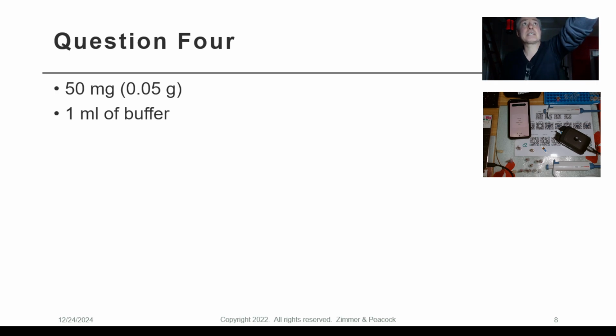I'm being very particular because at this moment we haven't started validating energy drinks. In fact, we have been buying them, but we have not done the science. So we'd love to get into energy drinks, but we have not done the science. So the only samples that we're supporting at this moment would be the more traditional hot beverages, for example, coffee and tea.